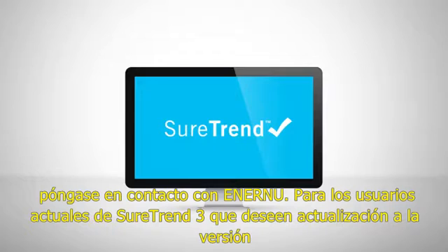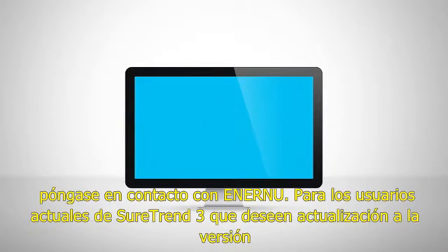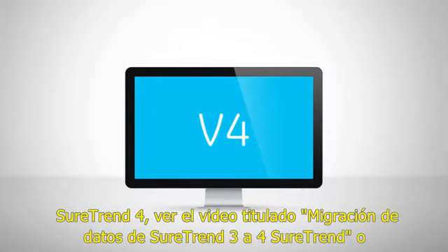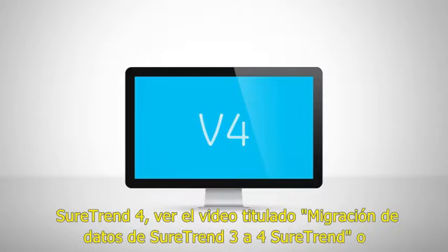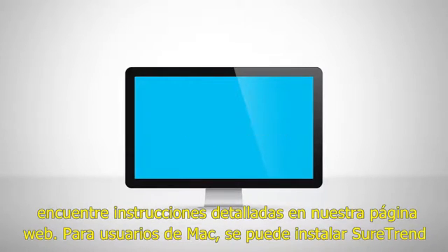For current SureTrend users upgrading to SureTrend version 4, watch the video titled Migrating Data from SureTrend 3 to SureTrend 4, or find detailed instructions on our website.